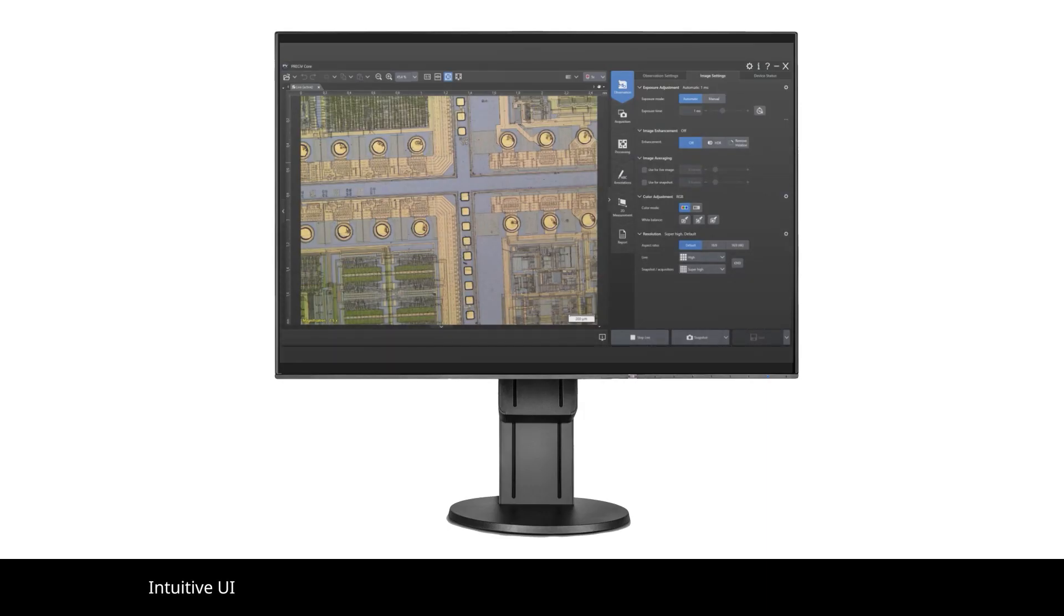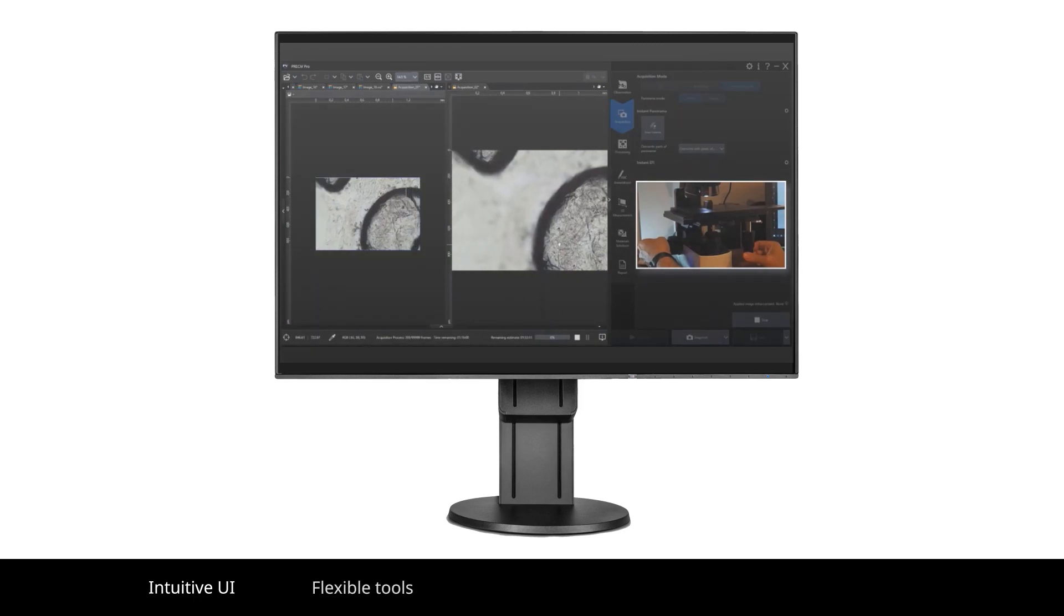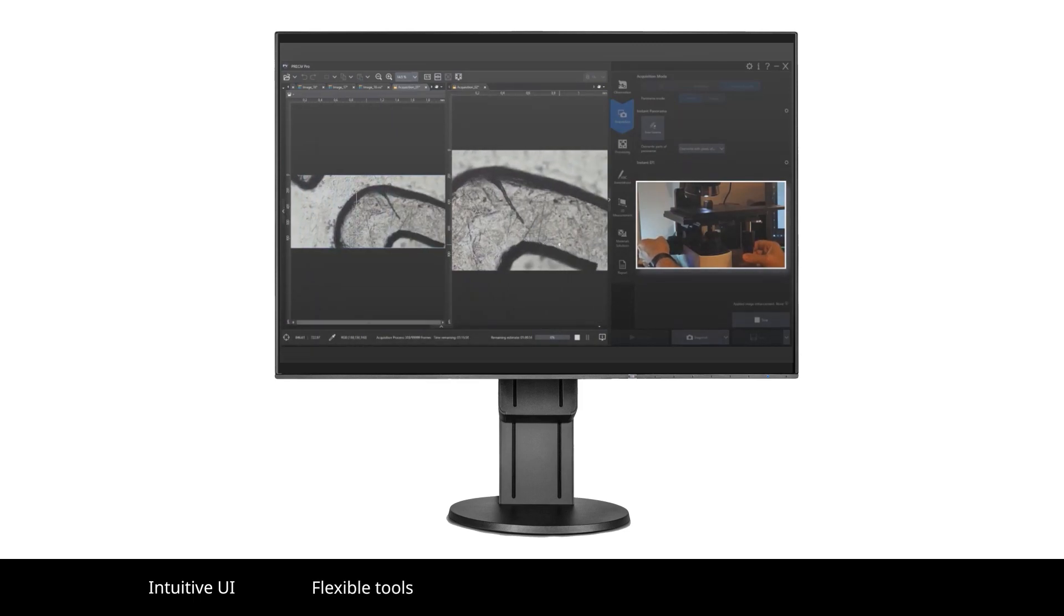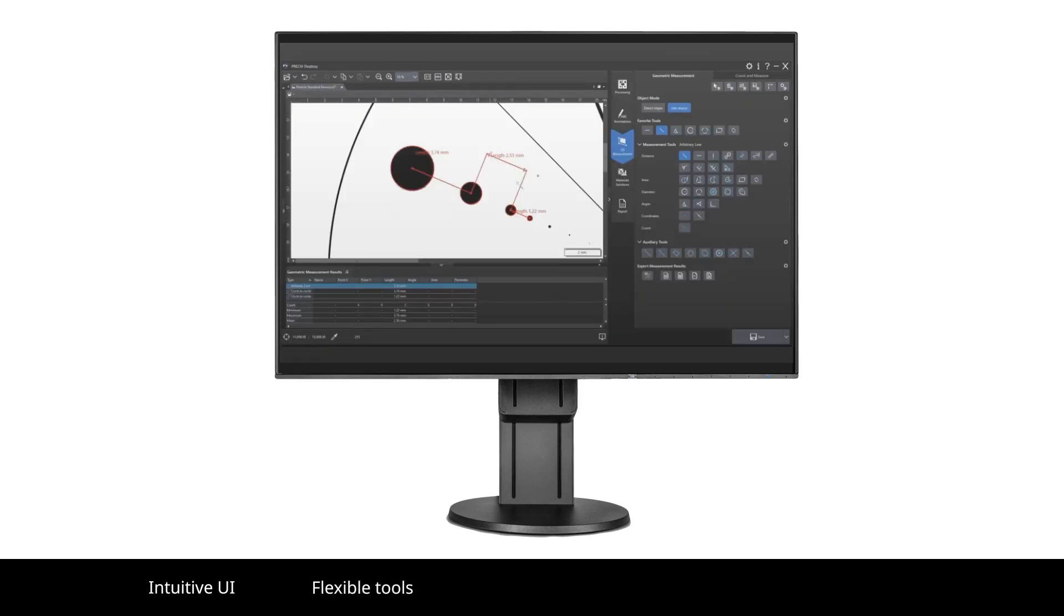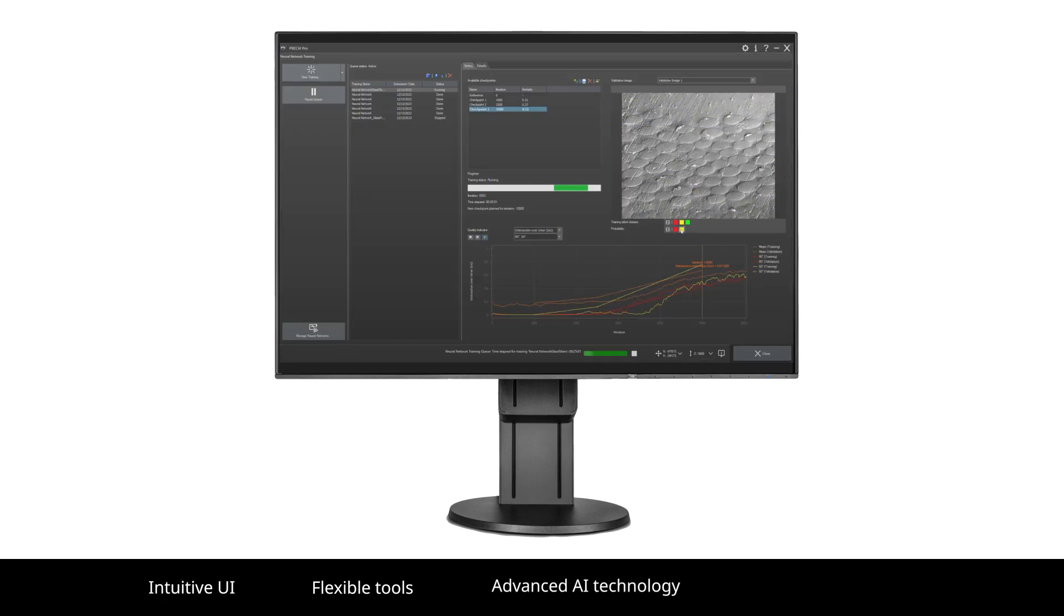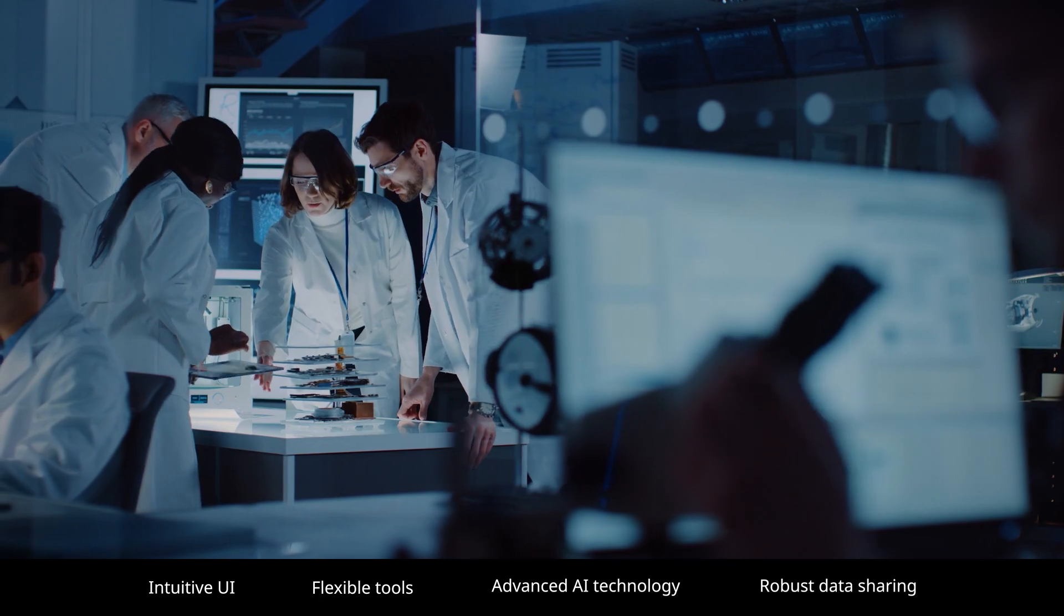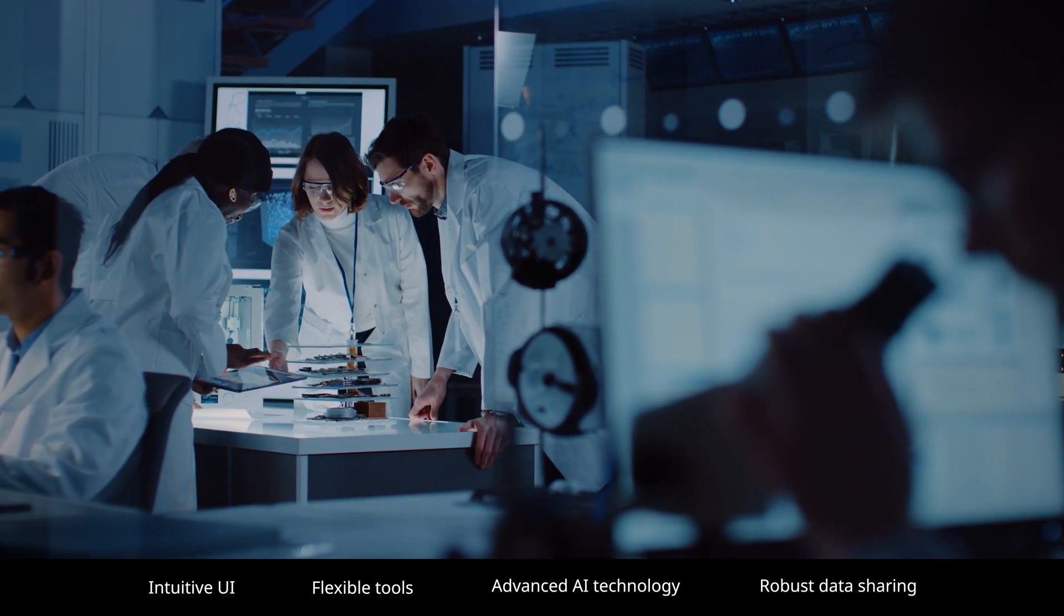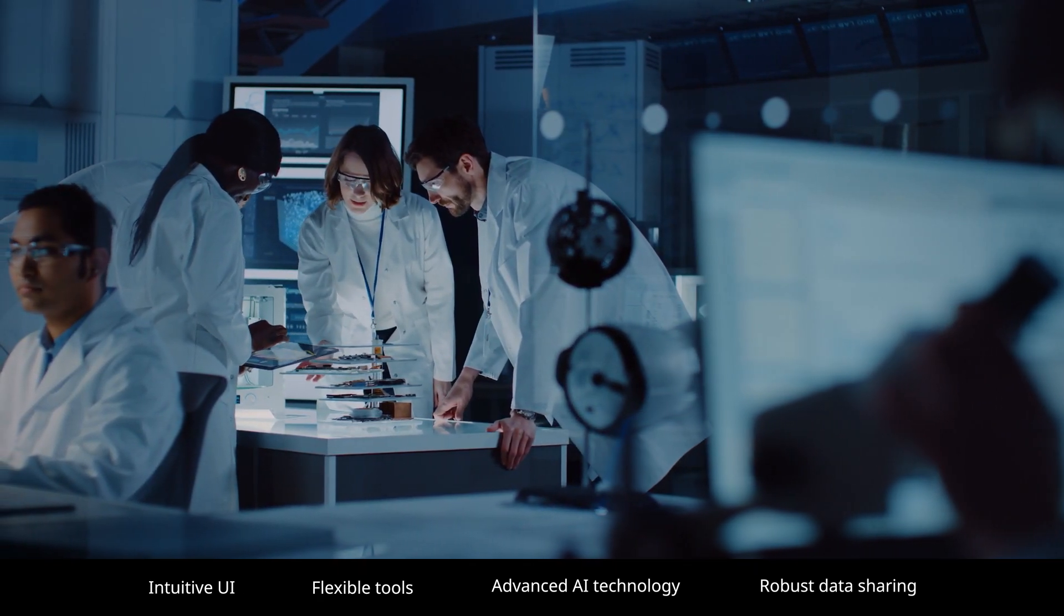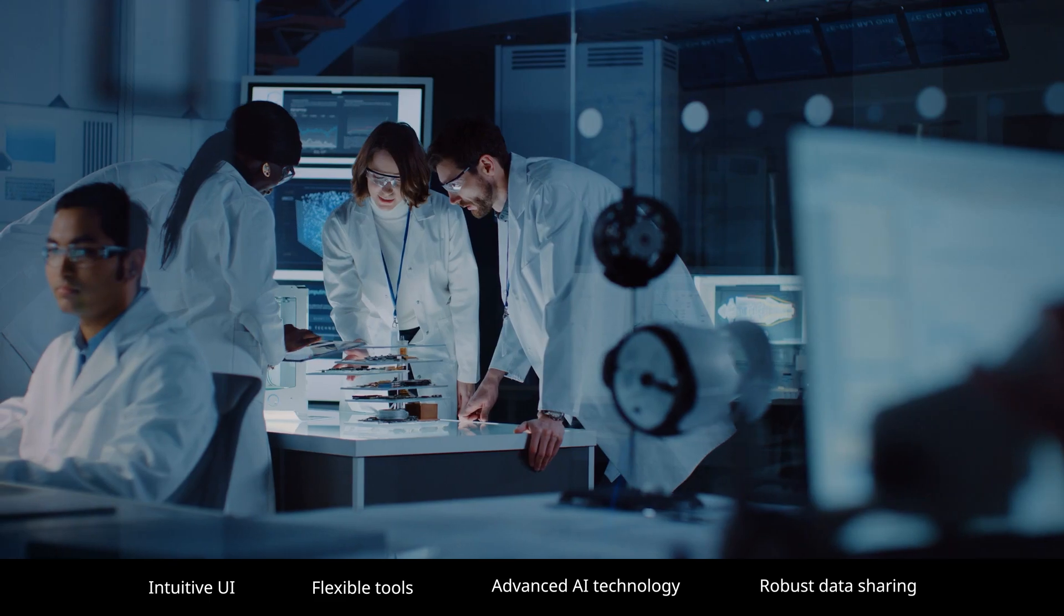With an intuitive user interface, a suite of flexible, easy-to-use imaging and measurement tools, advanced image analysis tools including AI technology, and robust data sharing and security features, Pressive Software makes your workflow fast and efficient.